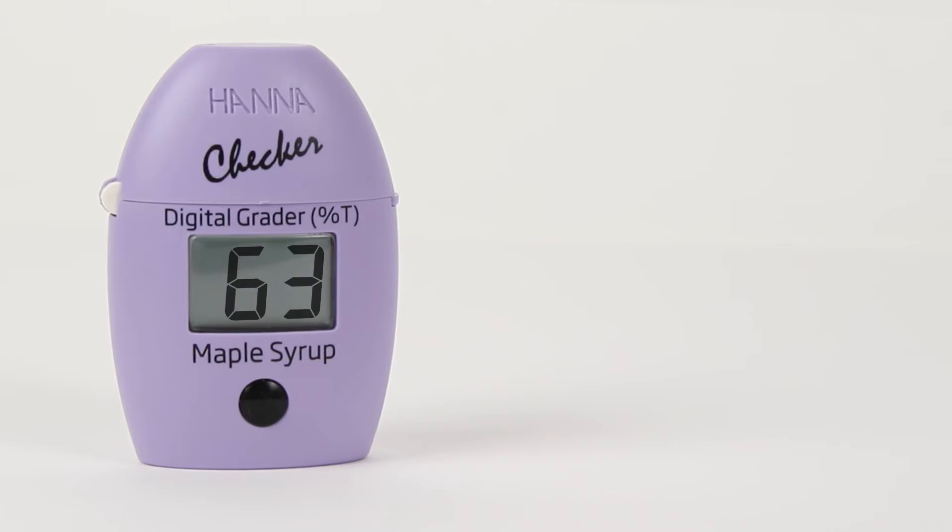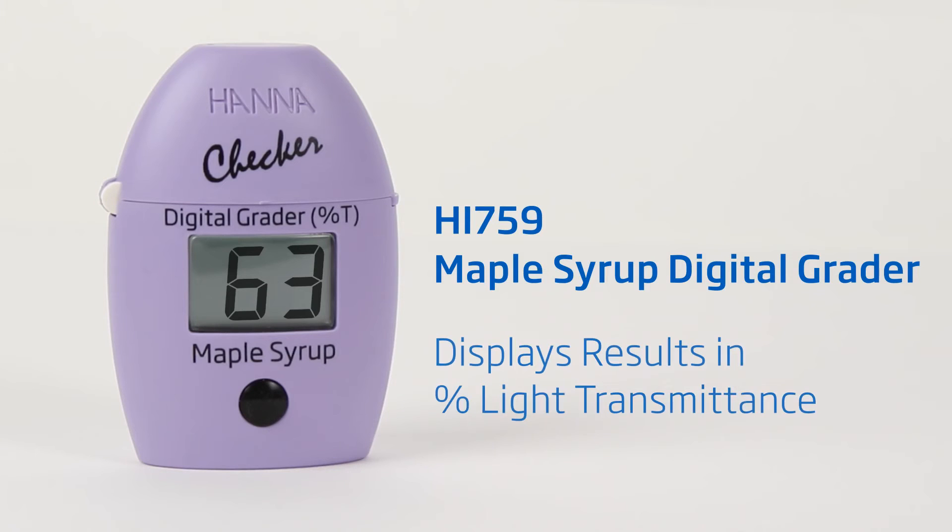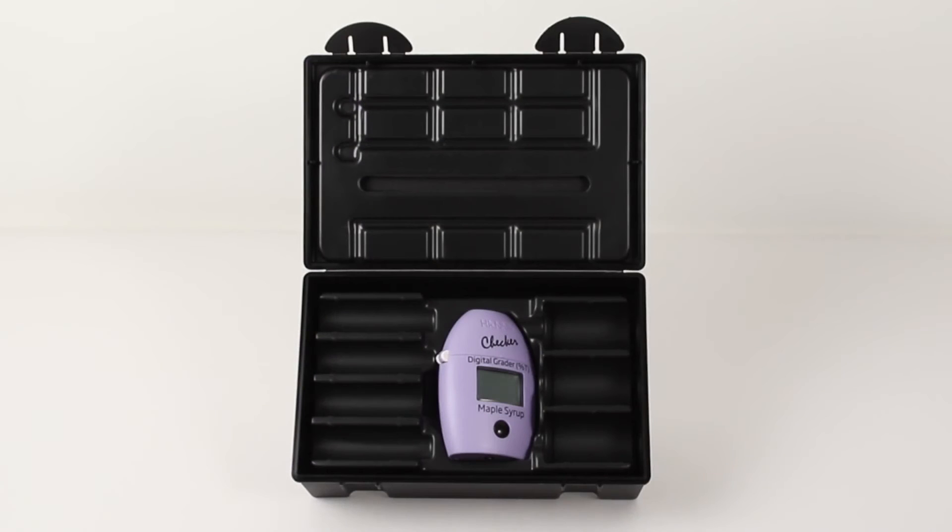In this video we'll show you how to take a measurement with our maple syrup digital grader. The digital grader is part of our checker line of products and displays results in percent light transmittance in accordance with the current color grading standards for maple syrup.